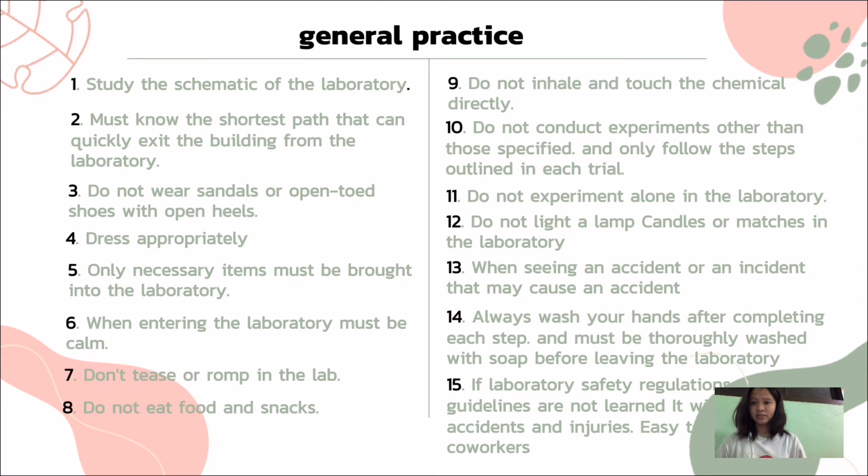Number 14. Always wash your hands after completing each step. Must be totally washed with soap before leaving the laboratory. Prevent chemical contamination.